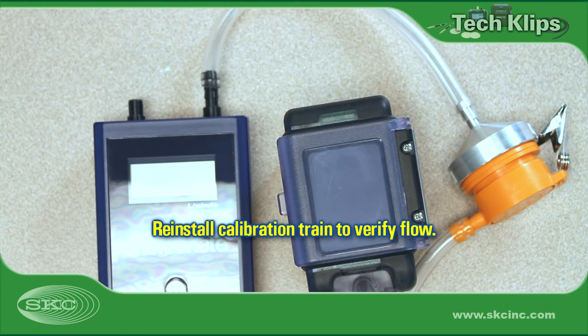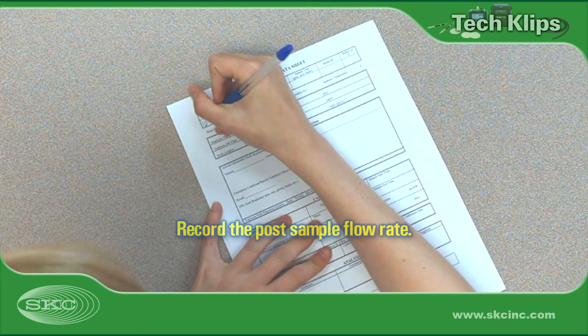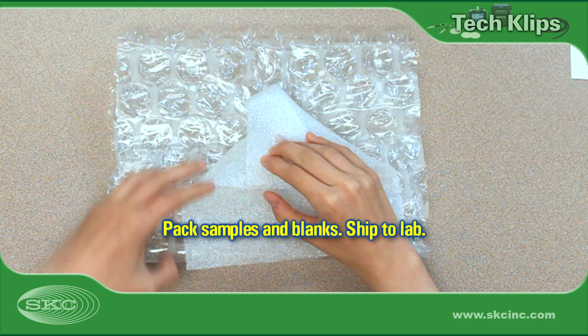Reinstall the calibration train to verify that flow is still within 5% of the desired flow rate and record the post-sample flow rate. Package all samples and blanks for shipment to an accredited laboratory for chemical analysis or post-weighing and gravimetric analysis.